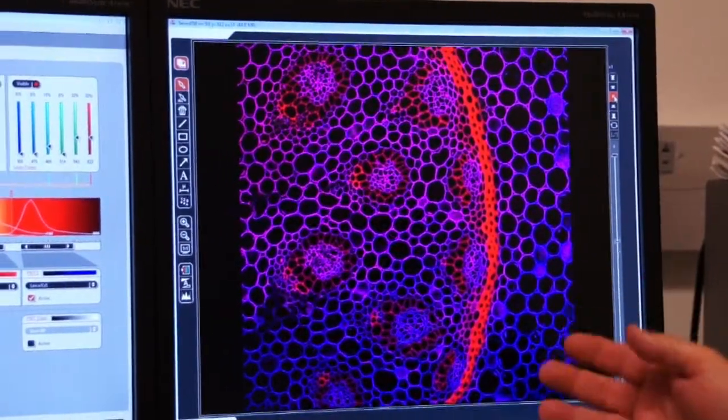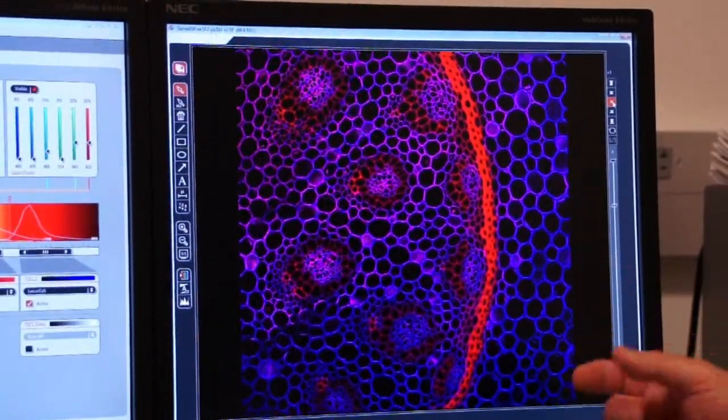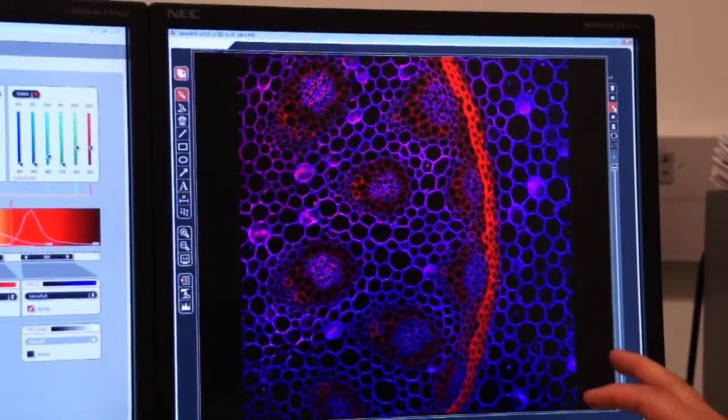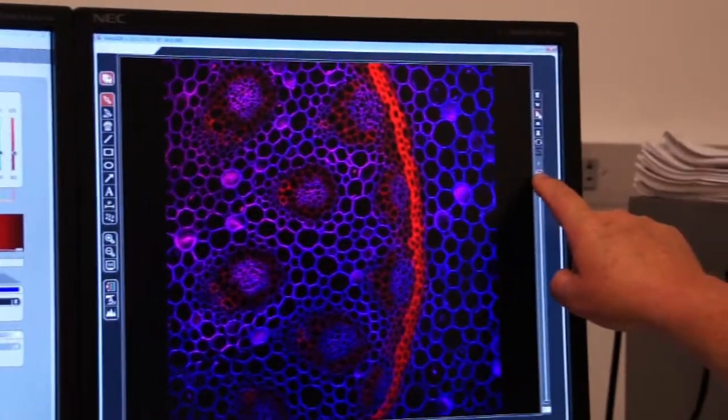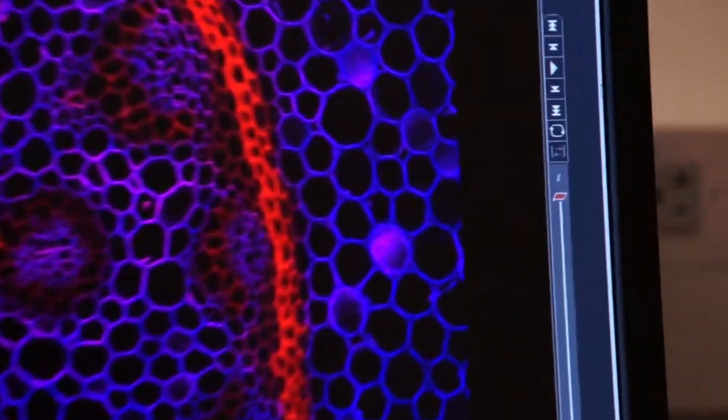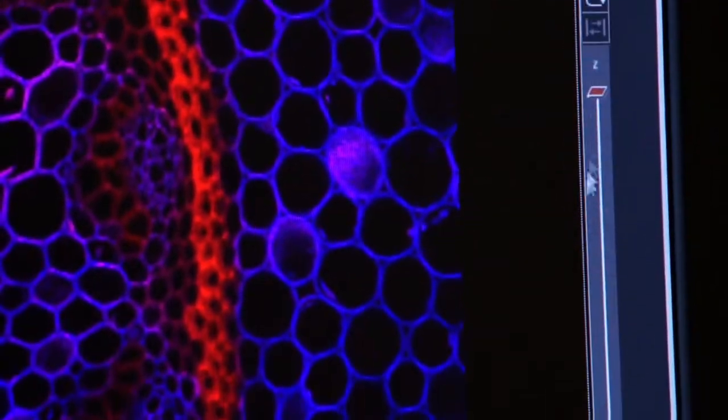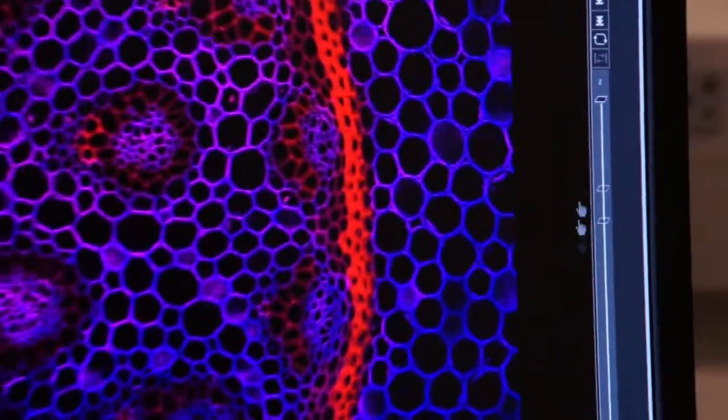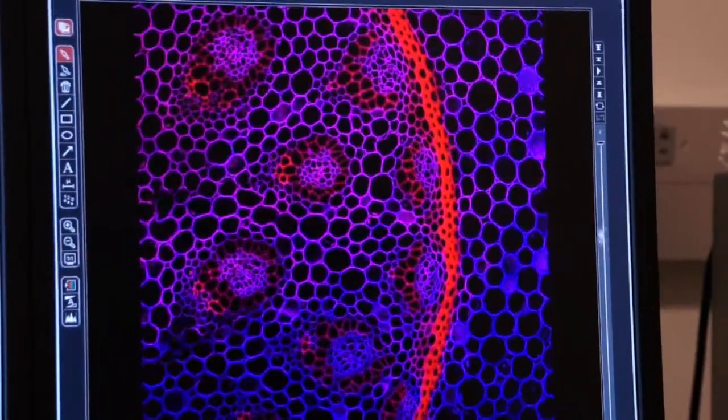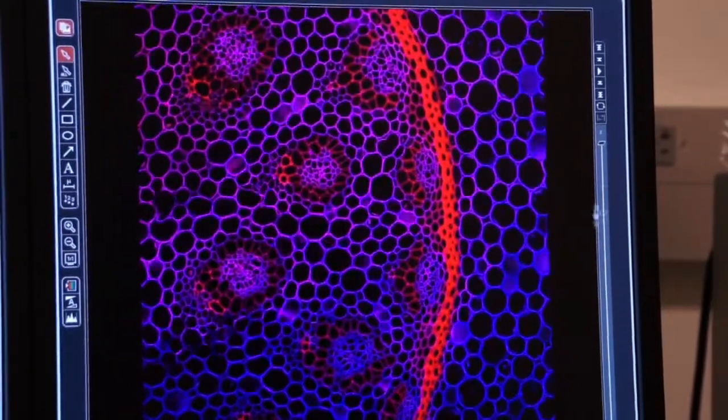So if there are features above and below in my tissue that I'm interested in looking at, I can see that with the Z-Stack. I can also grab this little frame on the Z-Line, and I can manually move that up and down. So let me grab it, and you can see that by moving this up and down, I can quickly see the different features that are in my Z-Stack.